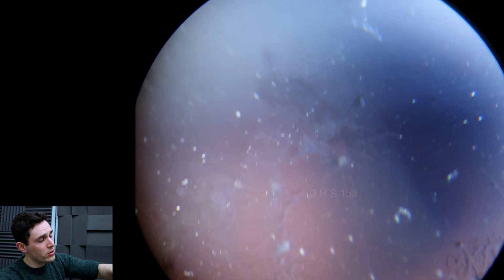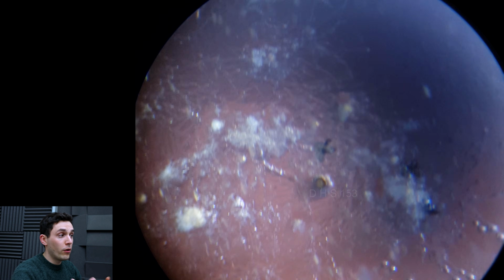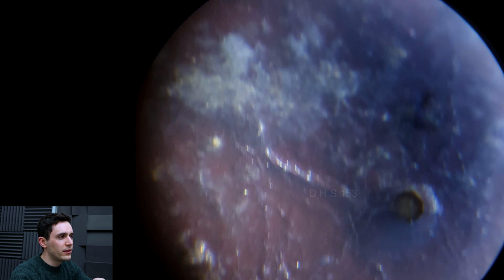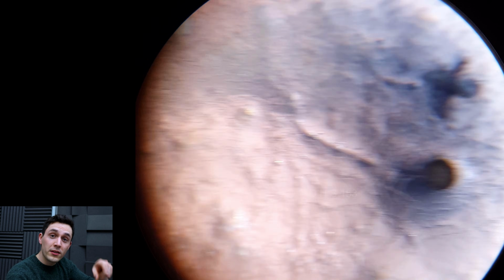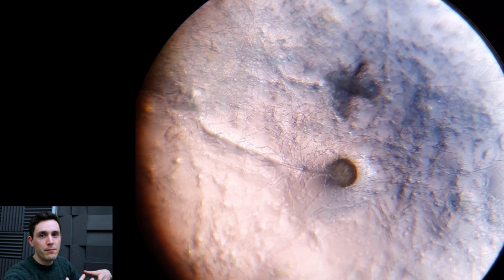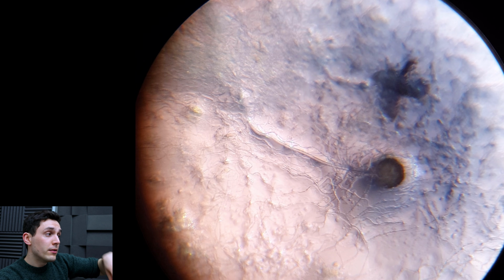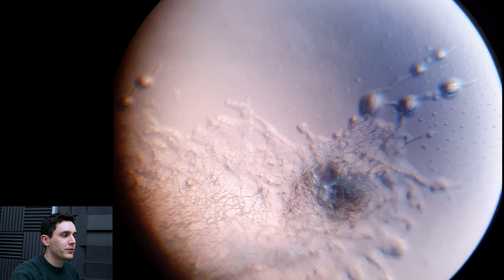And at high magnification, you can see here, again, the mycelium of the fungus growing on that and feeding on those resources. The little strands we call hyphae. Like the little stalks that the spores rest on, that's a hypha, and the mycelium is made up of hyphae. What the hyphae do is they're all interconnected together, and they secrete digestive enzymes, which are then sucked back into the network and feed the fungus.